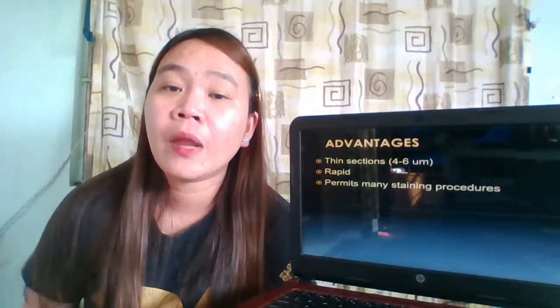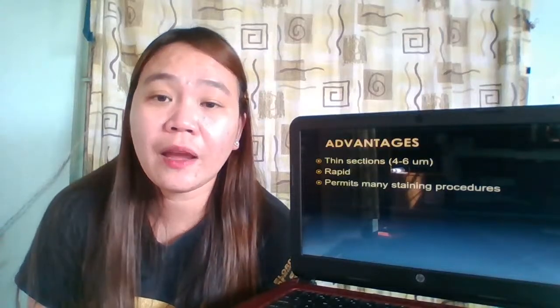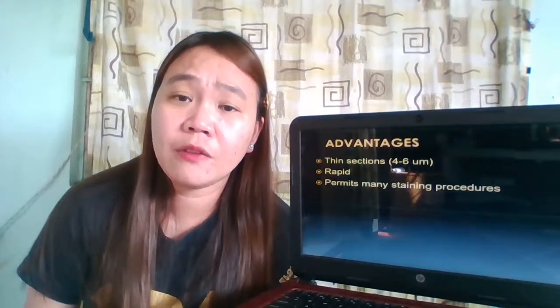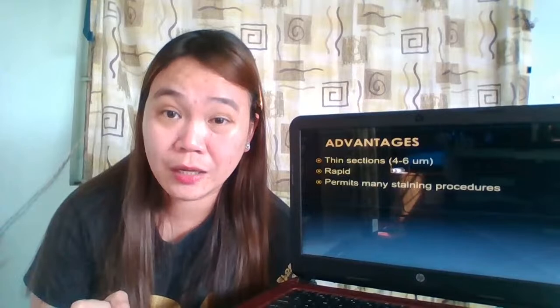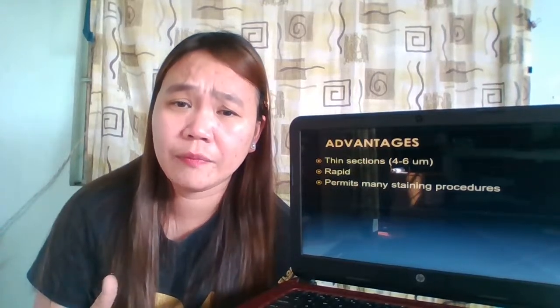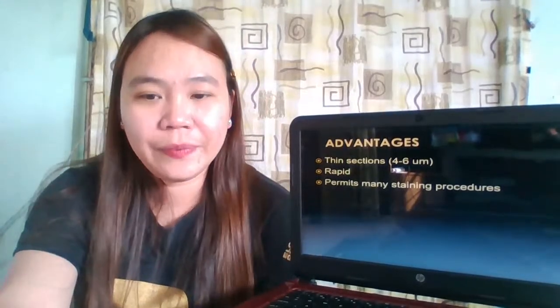Another, just like what I mentioned a while back when we were discussing the purposes of infiltration, paraffin impregnation allows possible storage of your processed tissue sample, or of your infiltrated or even embedded tissue sample. Storage is possible.